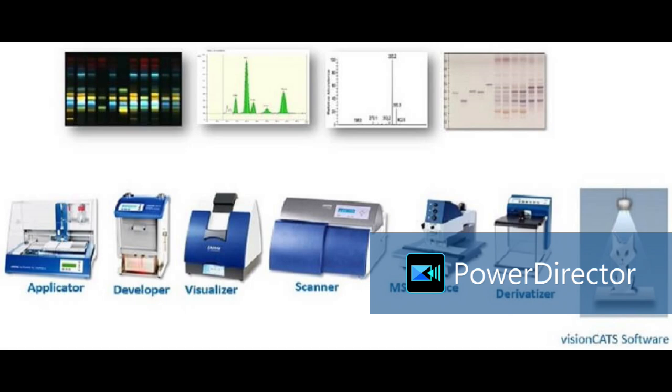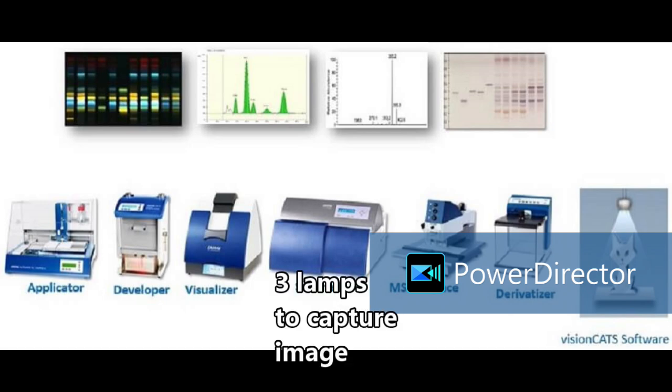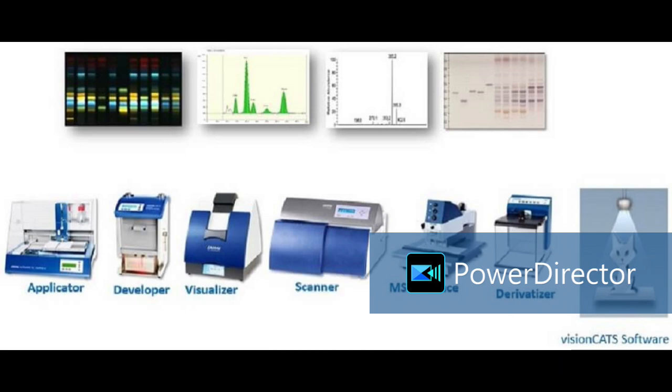In that first is visualizer, Camag TLC visualizer 3 we are using. Here there are 3 lamps, deuterium, tungsten and mercury, to capture plate images under different illuminations. Deuterium lamp is for generation of UV light 254 nanometer. Tungsten lamp is for 540 nanometer white light generation, and mercury lamp is for 366 nanometer fluorescent light generation.